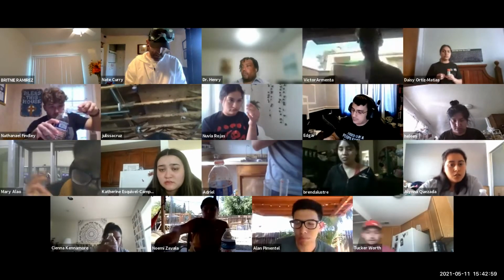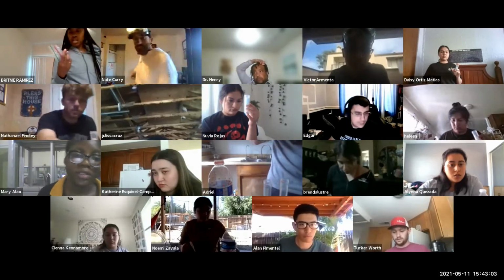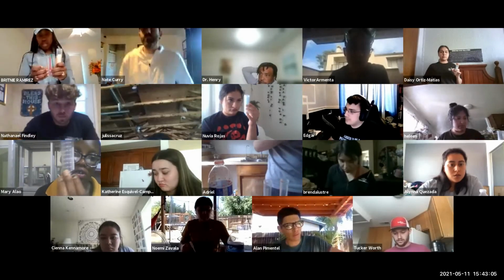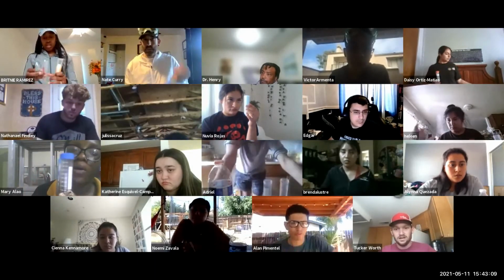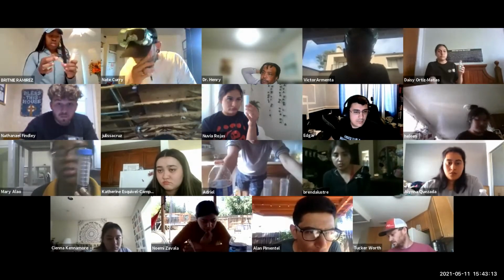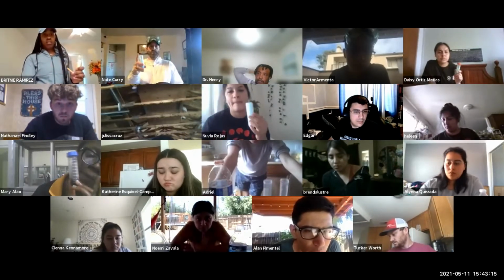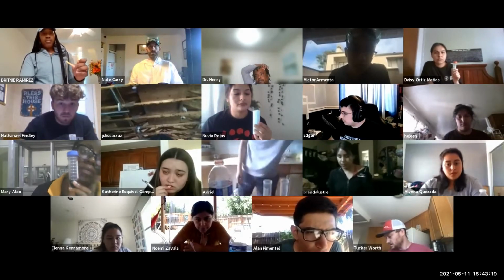Dr. Henry, at what stage is this? Is this after adding 10 milliliters of solution 1 to a conical tube, then you add the dishwashing soap? That's right. So that's 10 milliliters of solution 1. And then you've already added the dishwashing soap? I've not added any of that. Okay, add the 2 drops of dishwashing soap. Okay.